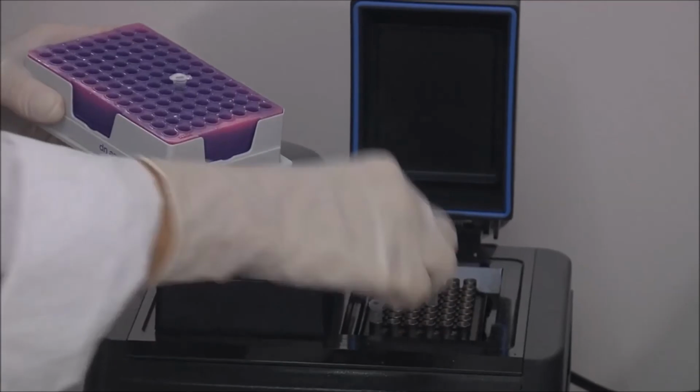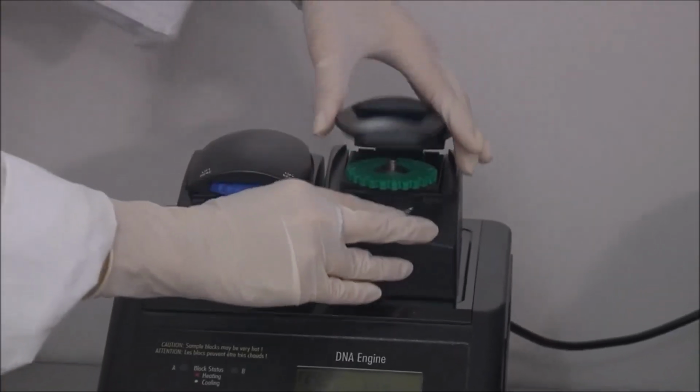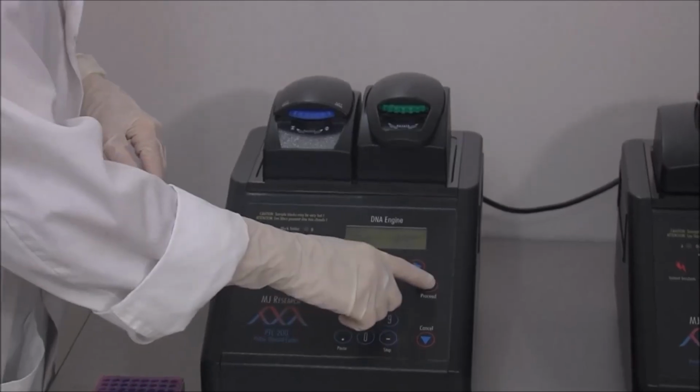Ở đây các bạn có thể chú ý là cái máy PCR chúng ta có phần block nhiệt và phần nắp nhiệt ở trên. Sau khi đặt vào các giếng, sau đó cô ấy điều chỉnh cái nắp nhiệt xuống để áp lên cái nắp của cái tuýp.